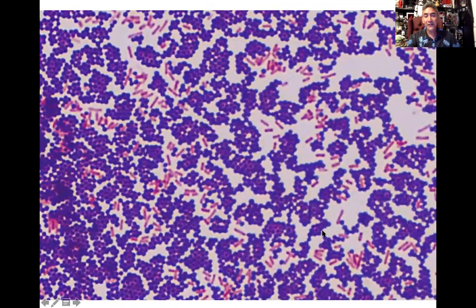So when we look here, we're looking at a much more dense population of bacteria. And then we bring in that term again, staphylo, right? So this is actually from the mouth of a toddler. So a young child, they never brush their teeth. They're always eating stuff. All this bacteria growing in there, right?